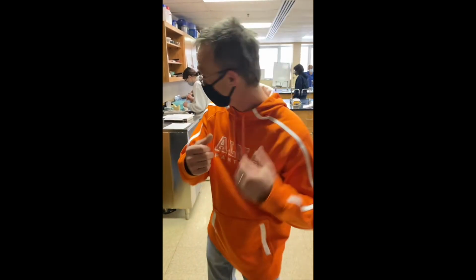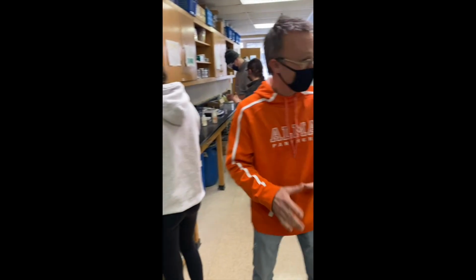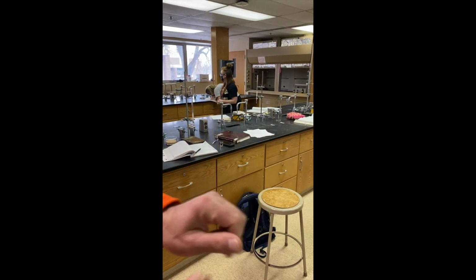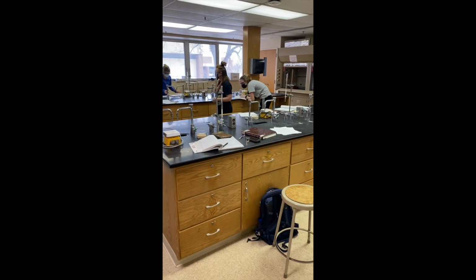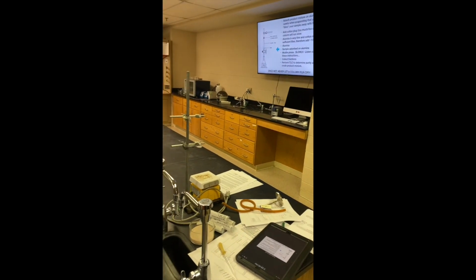Since my office is kind of boring, why don't we go walk around and see what some students are doing? This is one of our organic chemistry labs. These are students in their first year, freshman, second semester. Come on down. What they're doing is purifying and isolating a compound within a mixture. They're weighing some things out here on this side. Over here, they're doing a technique called column chromatography, which requires the little white powder in these long glass tubes. They're just getting started. If we come around over this side, you can see we've got a nice TV screen that our instructor is using to display the experiment for the day and get some tips. Now let's go look at some cool instrumentation that they get to use.